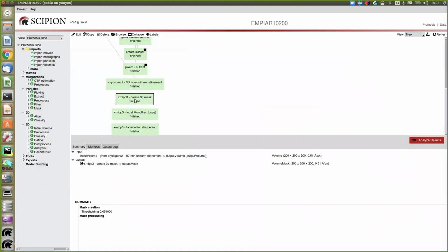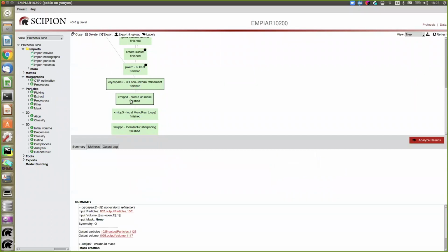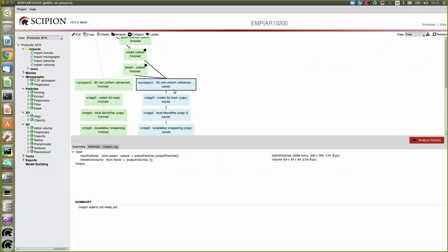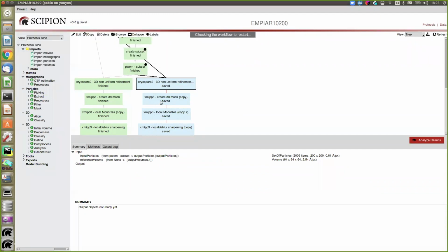And basically, I wanted to show you how you can copy. So let's say I'm not happy with this run. I could select all this stuff and make a copy. The copy usually just doesn't display in the right place, but then I have a copy, and now I can run this again and restart this whole thing, changing some values or not.